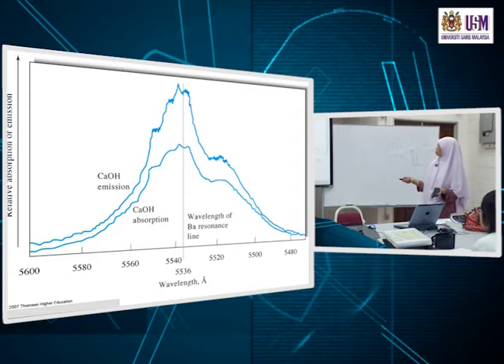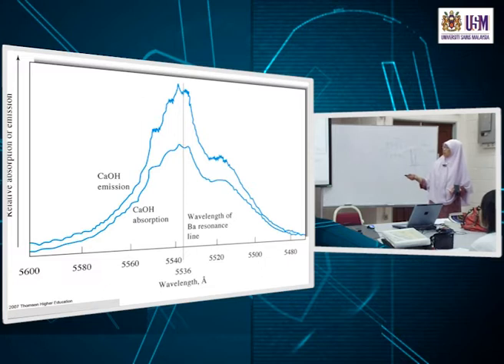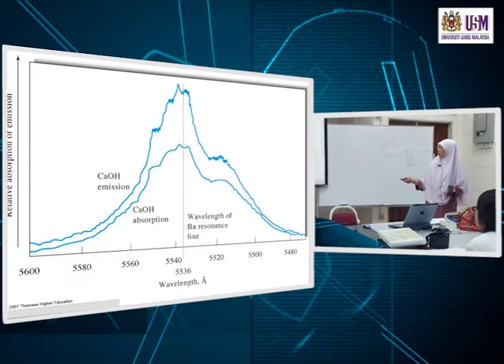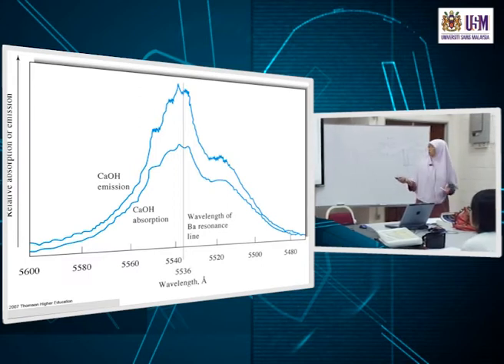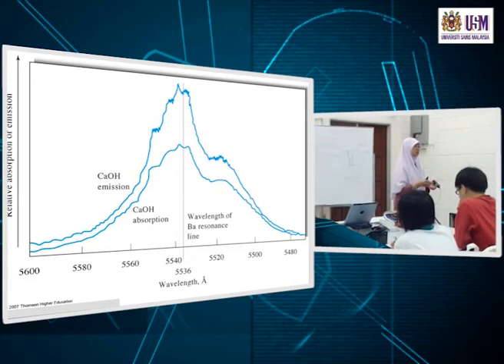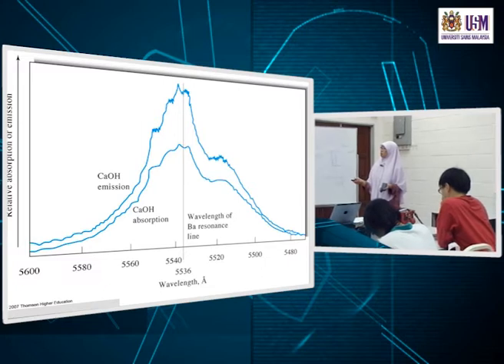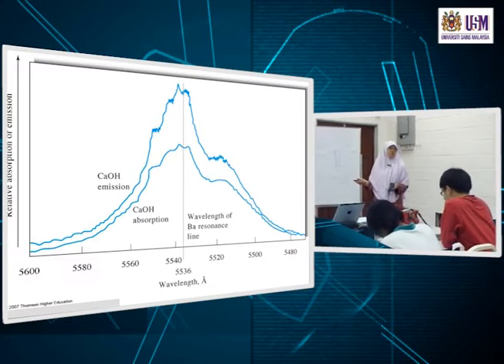What we want to show here is the barium line. Let's say we talk about emission lines: the barium emission line is at 553.6 nanometers. If in that same sample there was calcium, calcium can form hydroxides. You're not talking about a precipitate, Ca(OH)2, no. Here you're talking about CaOH as a species. This species, CaOH, is not an atomic species, it's a molecular species.